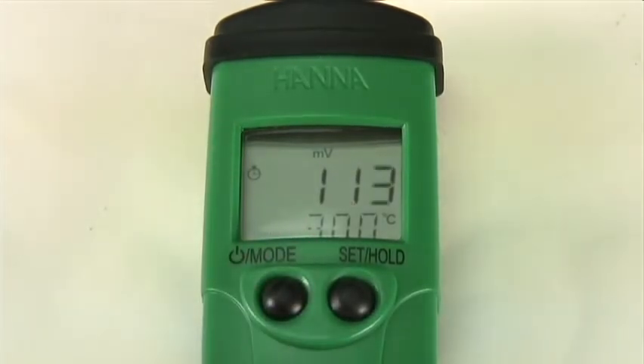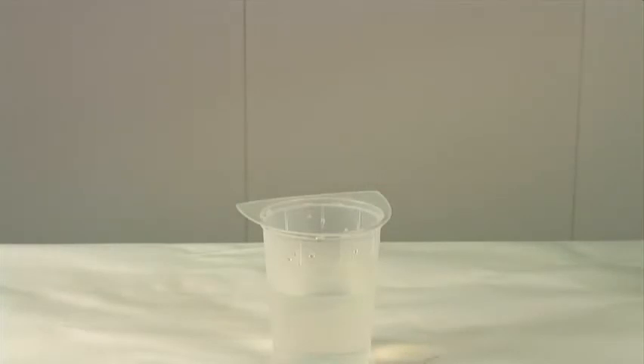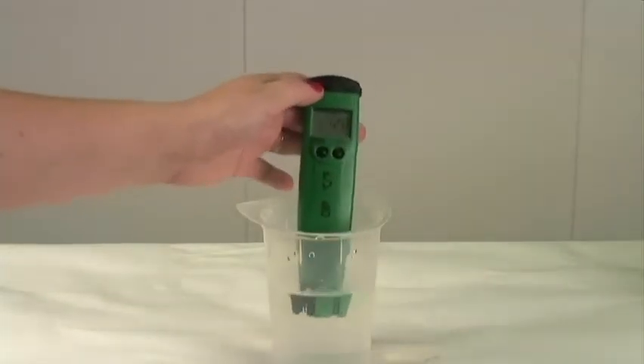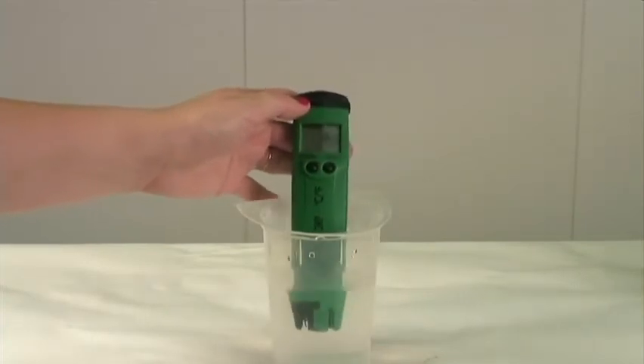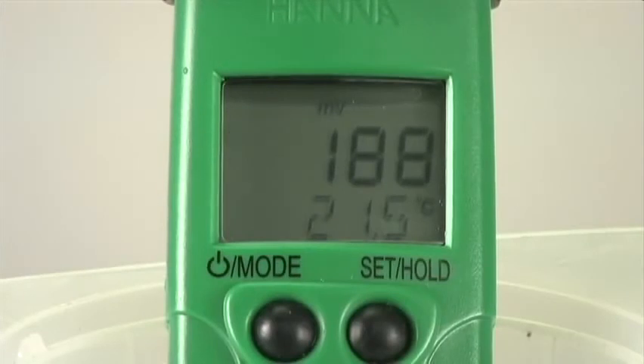Now let's go ahead and take a measurement. The meter is factory calibrated, so there is no need to calibrate before taking your measurement. Simply submerge your electrode in the water while stirring gently. Once the stability symbol in the left hand corner disappears, the measurement is finished.